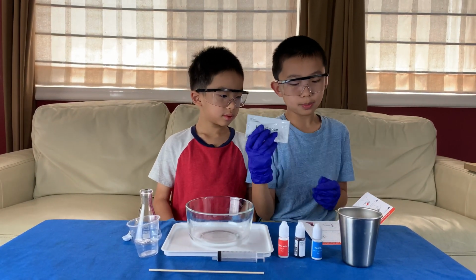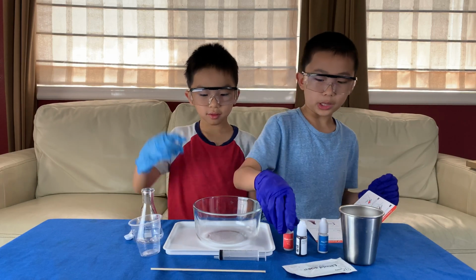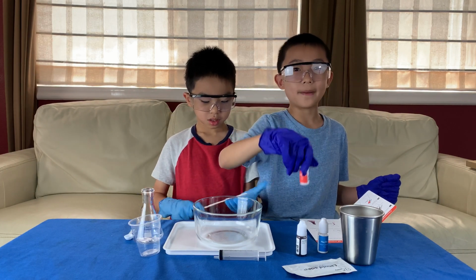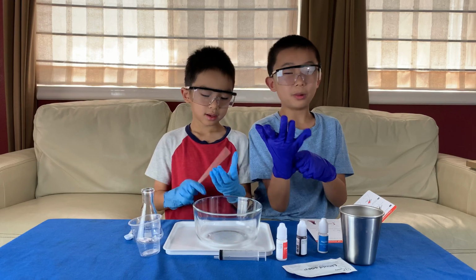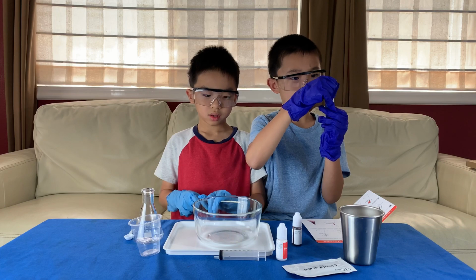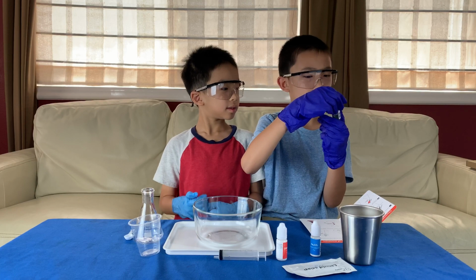We'll also need the liquid soap, a bowl, and these 3 chemicals. One of them is the citric acid, which has 10 grams, and it causes serious eye irritation if it gets in our eyes. But that's fine because we have goggles, which also came from the starter kit. We also have gloves, which came with the chemistry of monsters. There's also sodium carbonate, which also causes serious eye irritation. And finally, there's anthocyanin, which is a food colorant, and this one is not dangerous at all, according to the label.